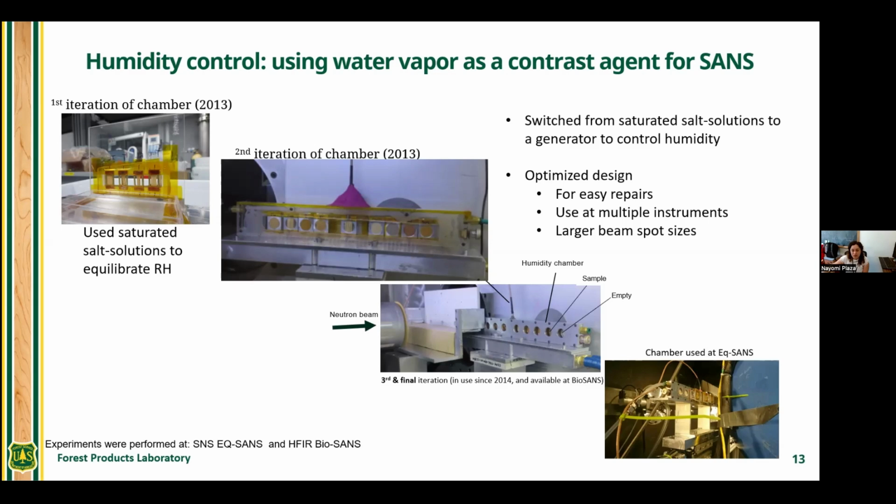So by looking at having extra stand-up bases, it would be compatible between different beam lines over at the Oak Ridge National Lab, which is where all the experiments were done. Here's at BioSANS and here's at EQ-SANS.